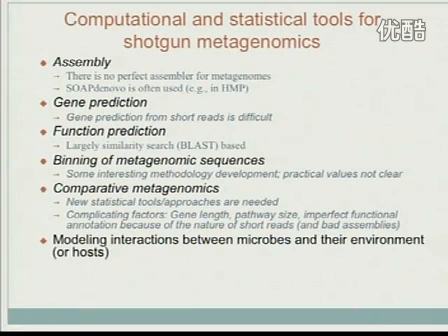So that's for 16S rRNA gene fragment analysis. But now people care more about the functional content of a whole community. So we need to do shotgun sequencing, and look at all the different gene fragments from the community. Once you have a mixture of DNA sequences from many different genomes, definitely, just like with a single genome sequencing project, you want to assemble them.